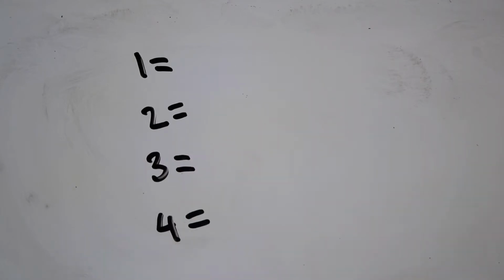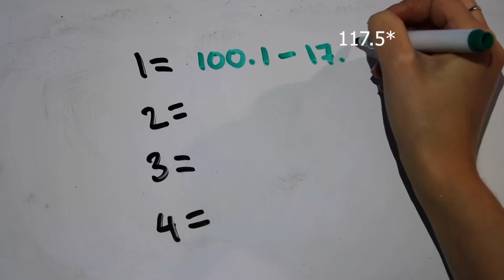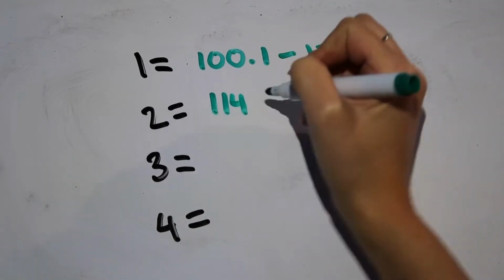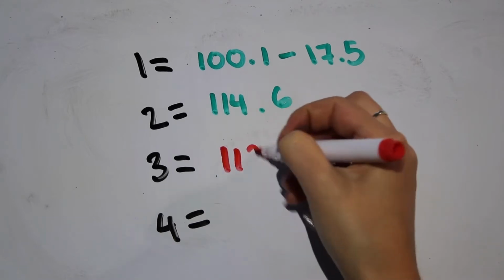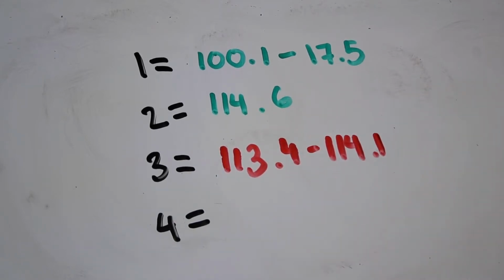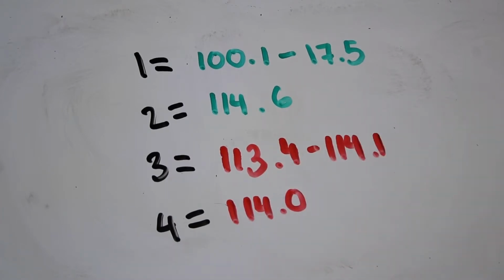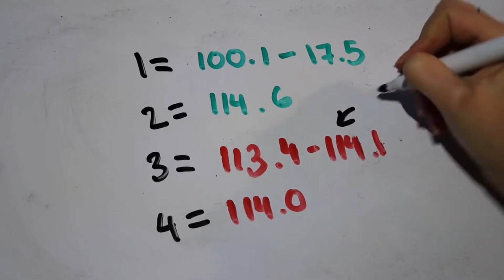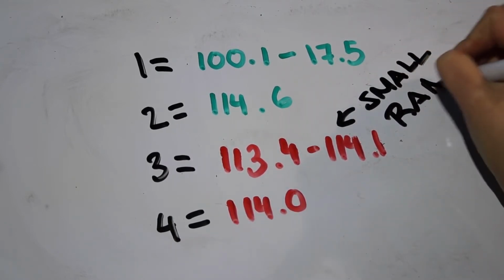But how do I know which my sample is? It's actually really easy. If the first melting point comparison you make yields 2 identical melting point results, for example, your sample is the first known compound of the pair. This is obviously assuming that the second comparison yields 2 rather different melting points as a result of the impurities in the mixture, being 2 different compounds, changing the range of melting.